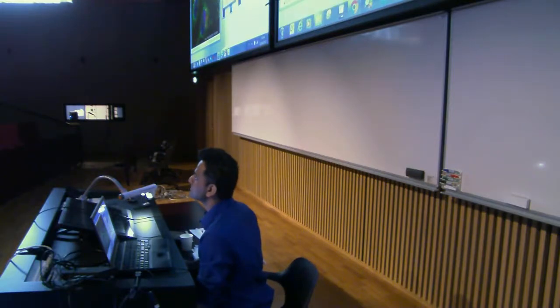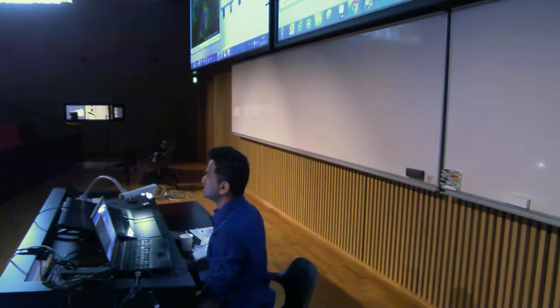I mean, for visualization, I think it's okay. Maybe you can actually test and measure if the true values of the pixels are actually changing. They shouldn't change, I think. This is just for visualization. Of course this is for visualization, and if you make it really strong and then still measure in the green channel one of those pixels, does it really change? You don't change the values, I think. No, the value would change for sure, because this is an interpolation.